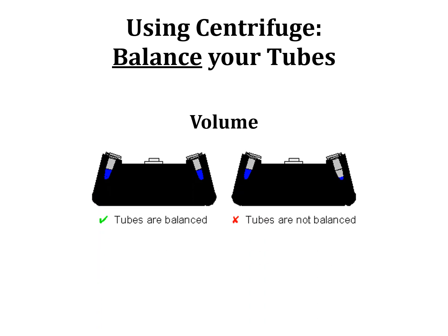We cannot put our tube by itself in the microcentrifuge. We have to balance it with another tube, preferably with the same type of liquid. And these two samples have to be balanced by volume. You can see here, guys, these two tubes are balanced because we have the same volume. Let's say, 100 microliters and 100 microliters here of water. Okay, so this tube is balanced.